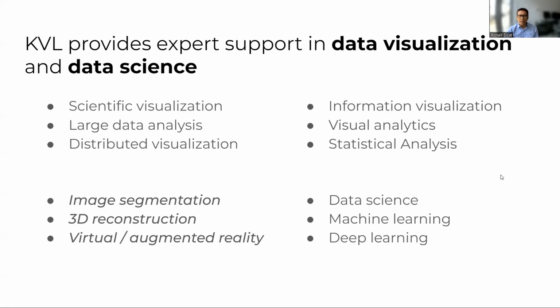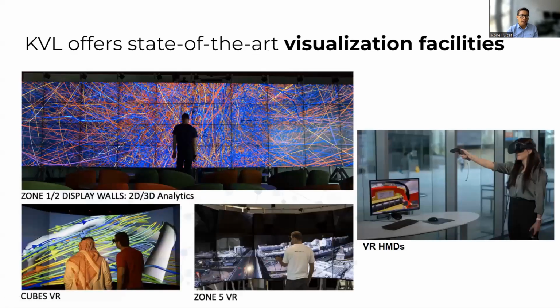Now, aside from expert support, we also provide state-of-the-art visualization facilities, such as this high-resolution display and several virtual reality facilities. For today, we will actually have a look at how to use the virtual reality head-mounted devices, or HMDs.